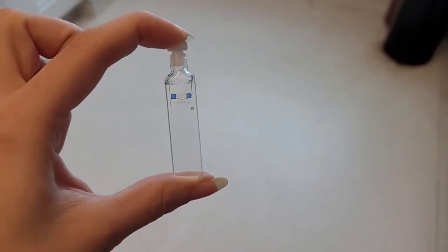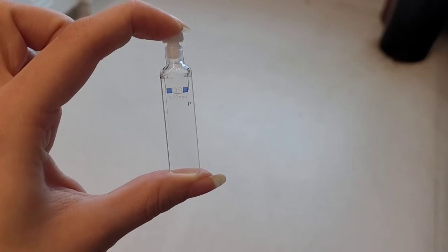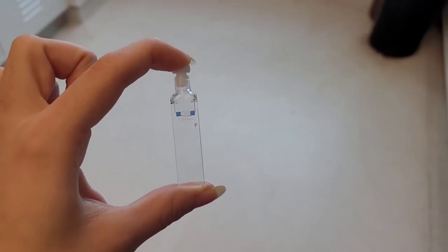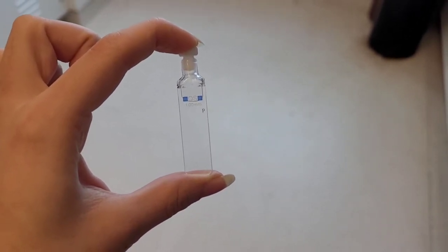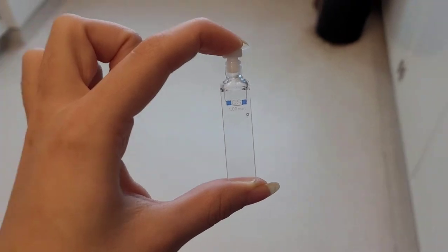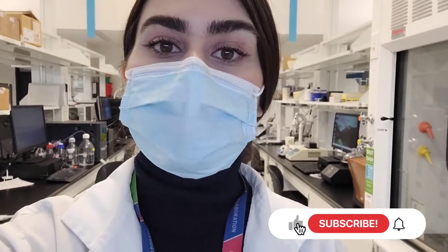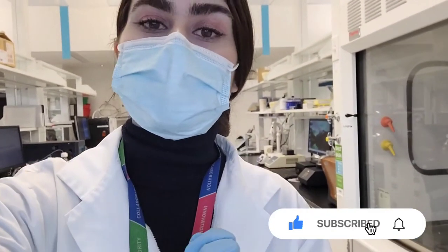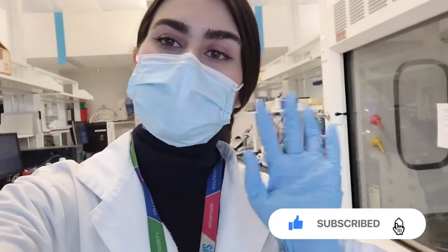Set out your sample and clean the cuvette again with ethanol and water for the next person. So thank you so much for watching the video. If you have a question, don't forget to comment, and I will do my best to answer your question. And thank you so much. Bye.